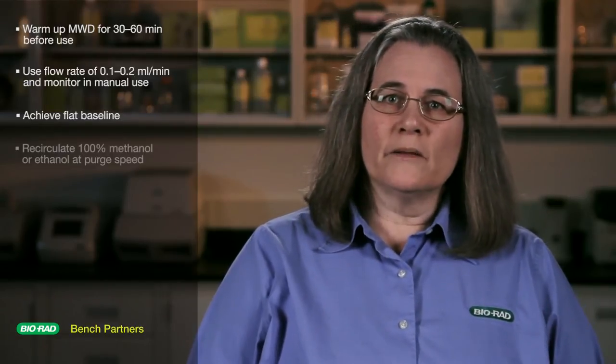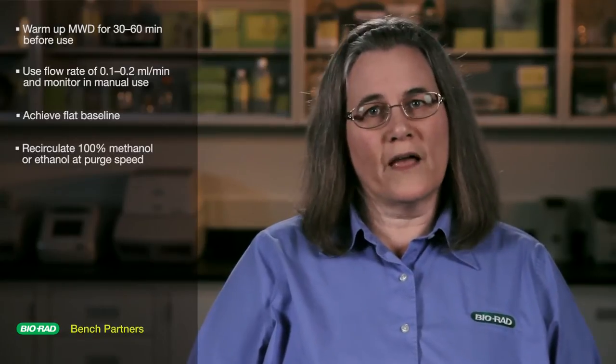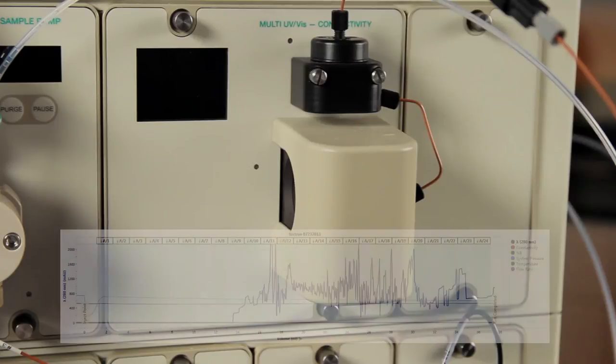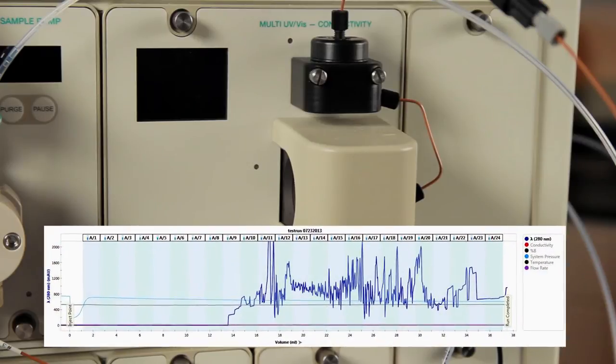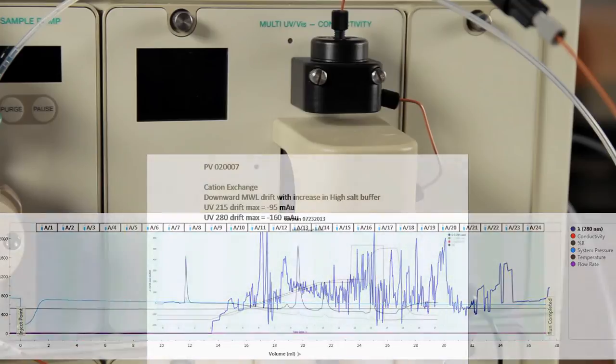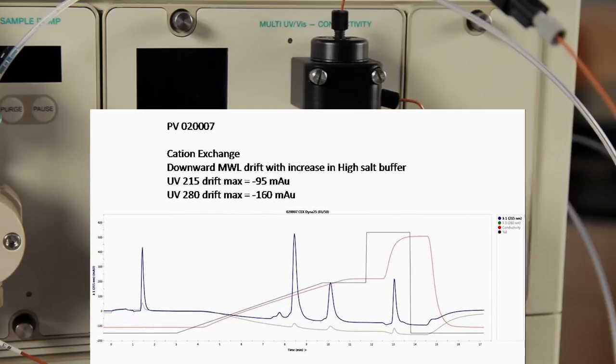Take any columns out of line and recirculate 100% methanol or ethanol through the system at purge speed. If the problem persists, it's very likely that air bubbles are trapped in the flow cell, causing the baseline to show a steady downward drift or even sharp spikes in the UV trace.